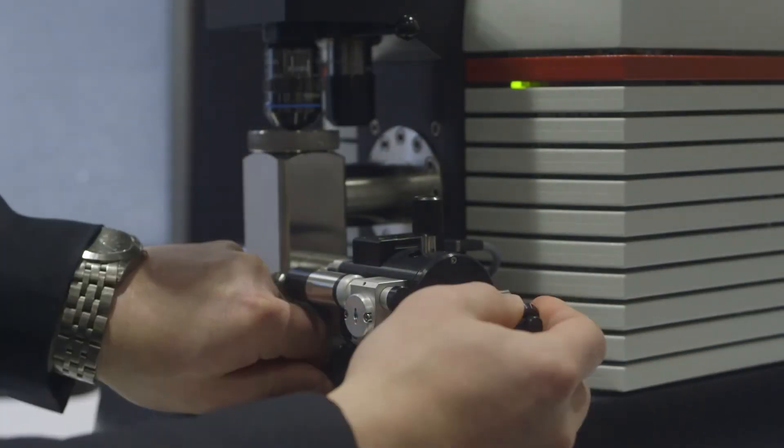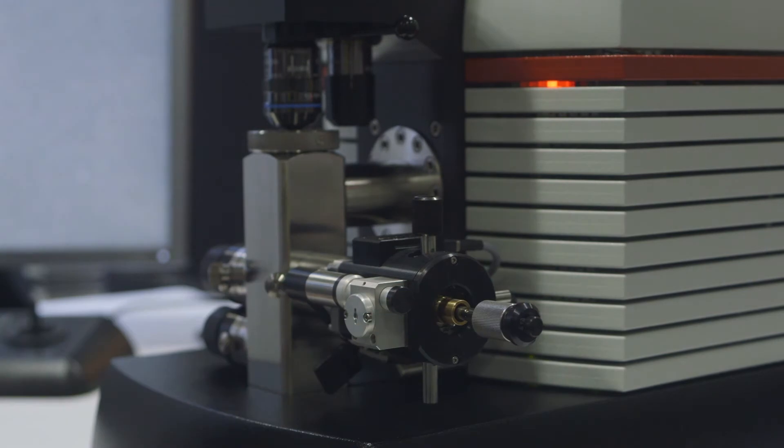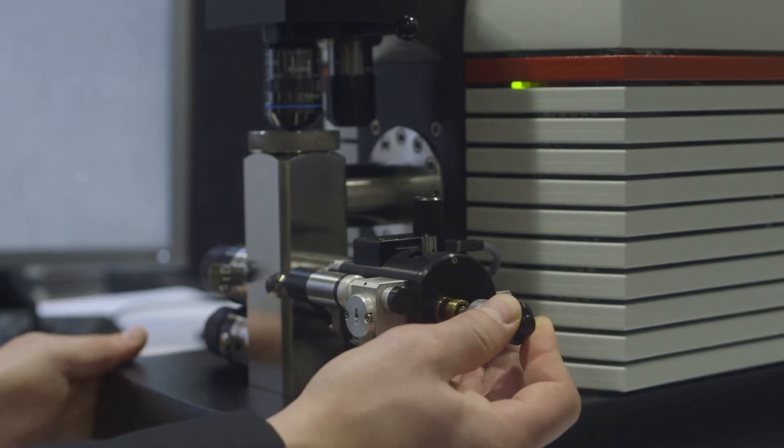All microscopes built on the LVEM platform don't require any special facilities for installation. Things such as special electrical connections, vibration isolation, or cooling water are not required for these microscopes.